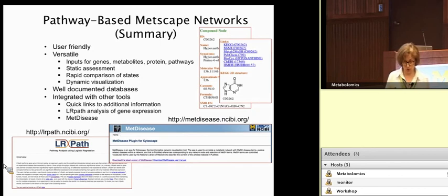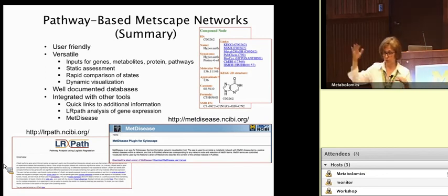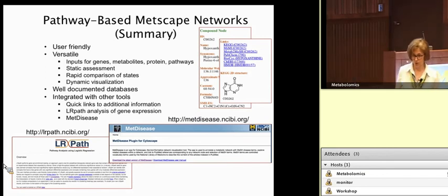What we are trying to do, and what I'm going to talk about, is predict the unknown features from metabolomics data, by looking at correlations between metabolites. The idea is essentially guilt by association: compounds that are co-regulated, or otherwise linked, would change in a correlated fashion, and that's what I'm going to talk to you about.